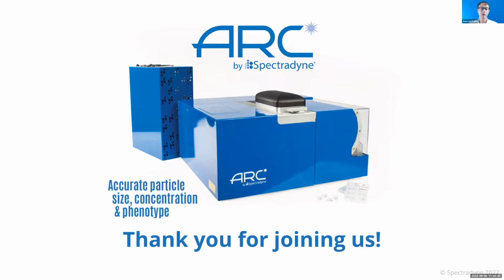There's a question from Jeffrey Clogston at the NCL, the National Nano Characterization Lab. Hi, Jeff. Jeff asked, since fluorescence measurements per single particle is possible, can you look at drug loading and extent in nanoparticles containing a fluorescent drug? For example, say which nanoparticles have no drug at all versus yes, there is drug present in it, and then how much drug is contained. That is an excellent question, and the answer is yes.